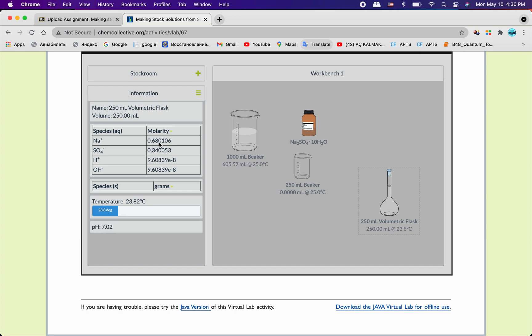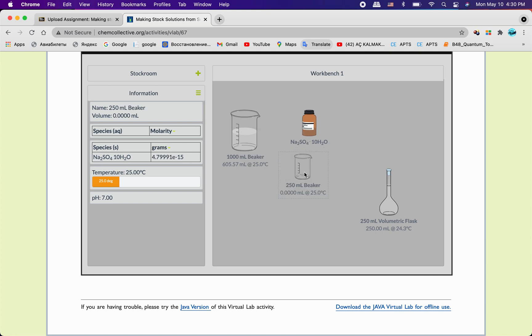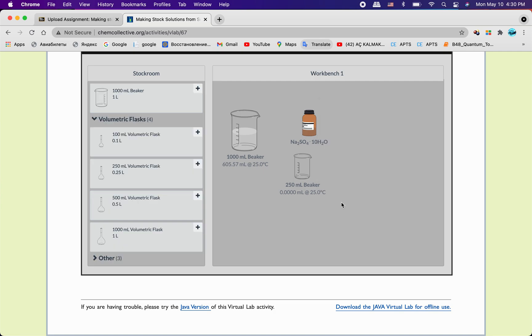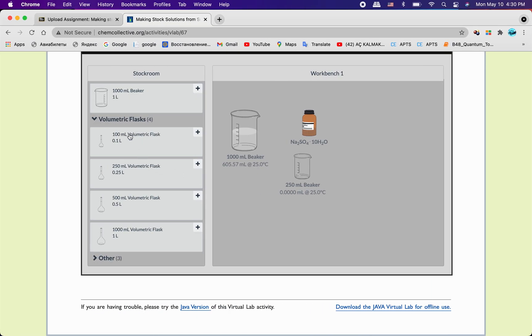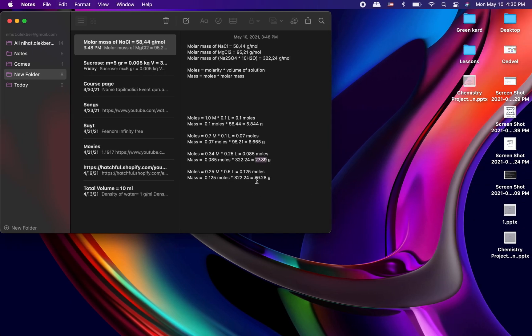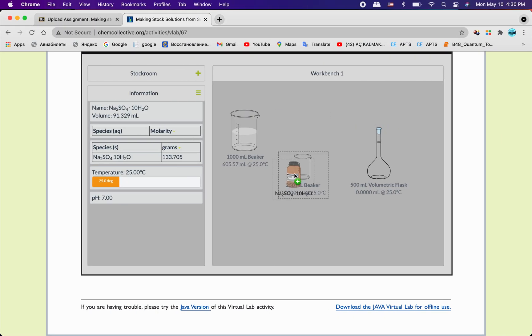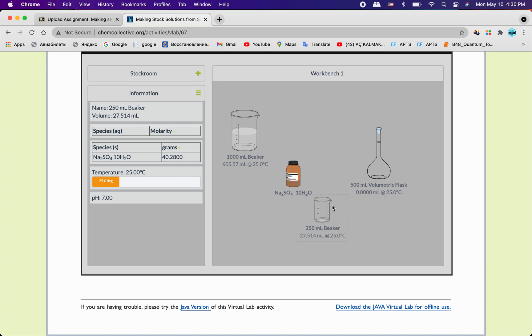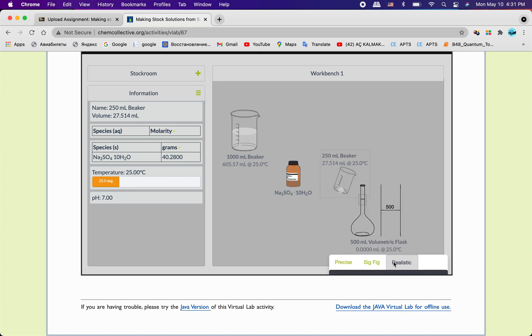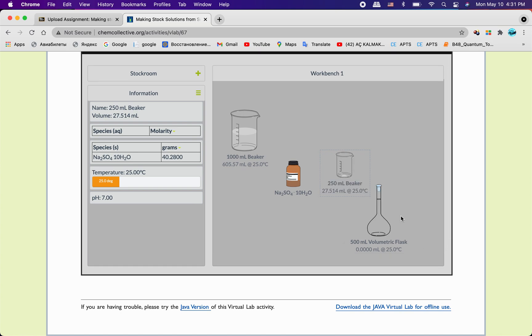Let me remove not that one, not beaker and volumetric flask, because we are gonna use 0.5 liter flask. And let me take this one. I will this time take 40, 28, and I'm gonna drop it right here. Here we go.